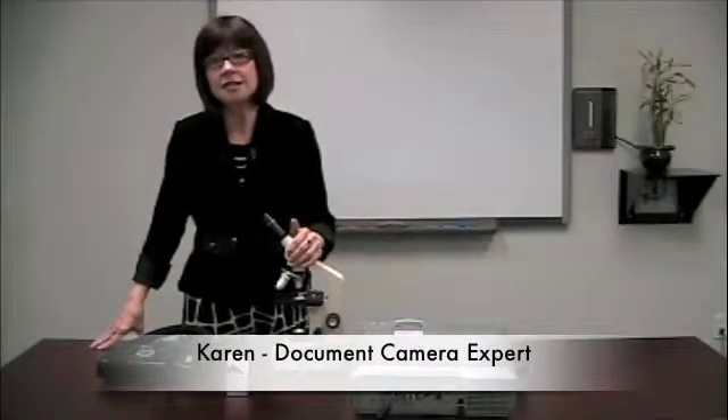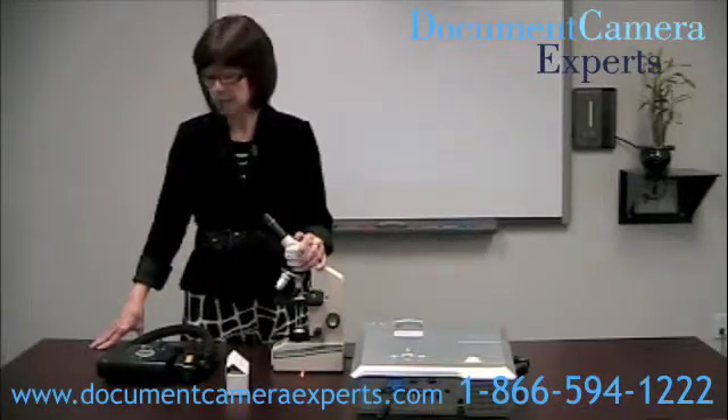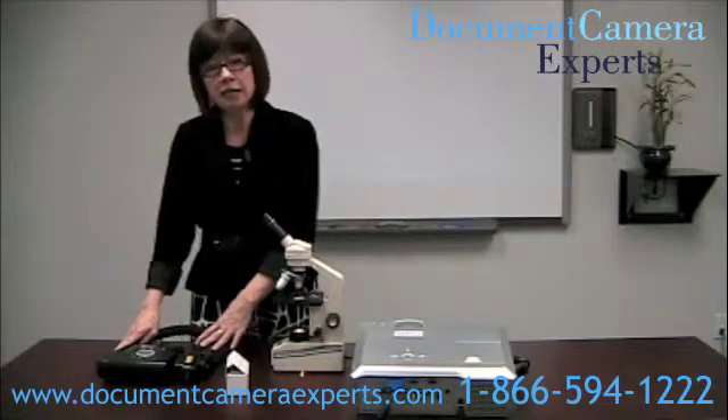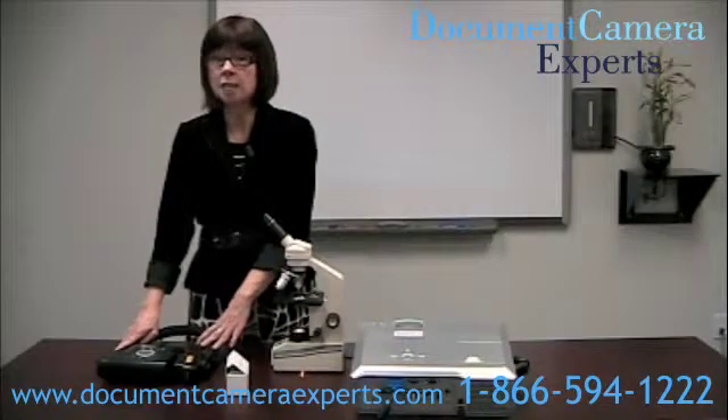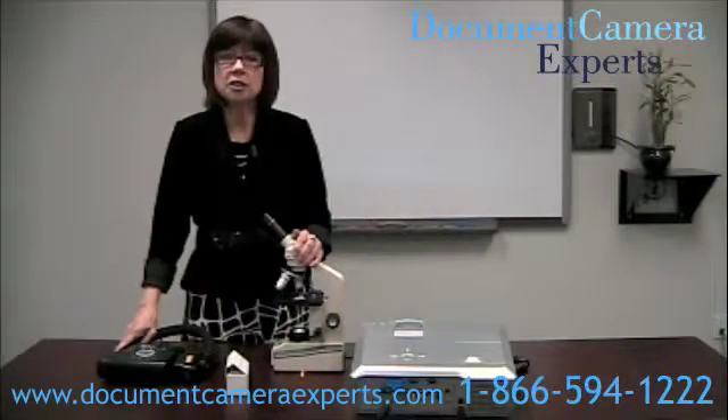Hello, I'm Karen Brooks Nelson from the Document Camera Experts. We're North America's largest supplier of document cameras. Here we have an AverMedia AverVision CP300 document camera, and we're going to attach it to this microscope, like one found in your school.